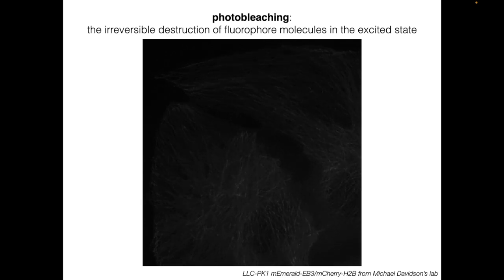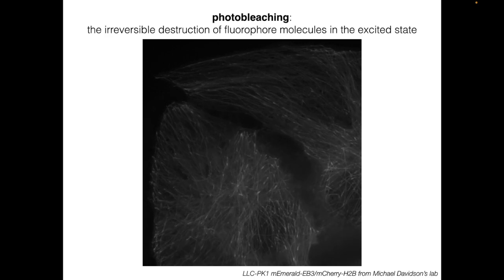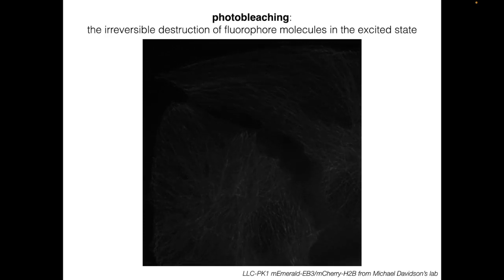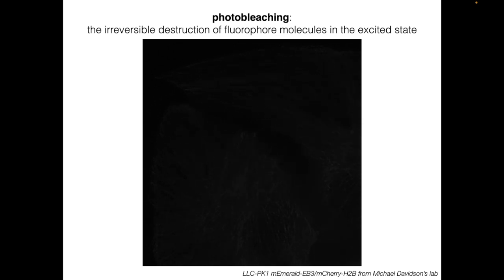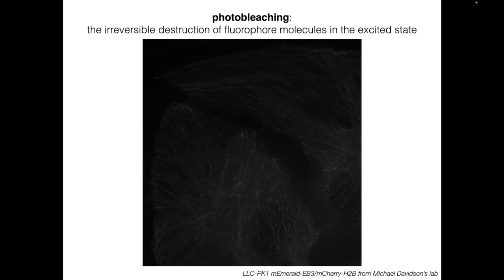Photobleaching is a problem for many types of experiments. If you are trying to measure fluorescence intensity, this is clearly a major source of error, because the intensity change we see in this example is due to photobleaching, not to any underlying biological phenomenon. But even if you're not measuring intensity, photobleaching can complicate your experiments — at some point in the time lapse, we can no longer get any useful information from the images because we've lost too much fluorophore.